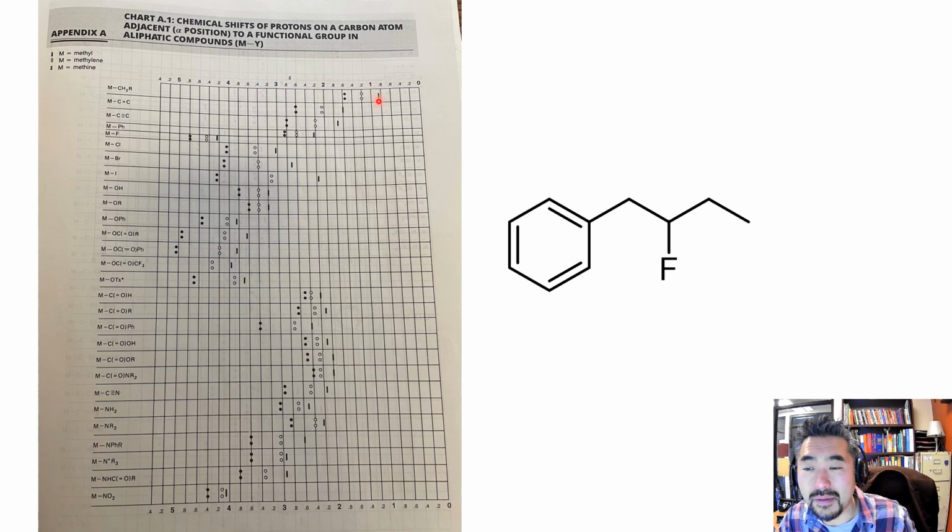This shows maybe 0.85 ppm or so. I think in practice, I expect this to be probably more like 0.9 ppm, but I guess I'm splitting hairs at this point. So this is probably around 0.9 ppm based on that.